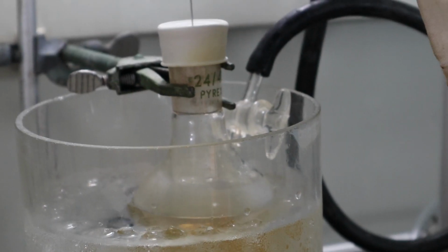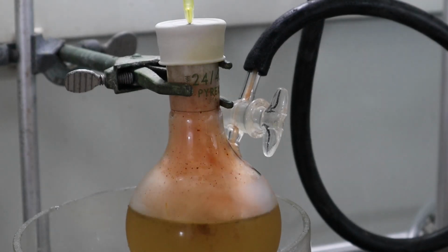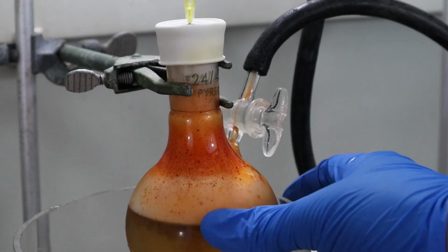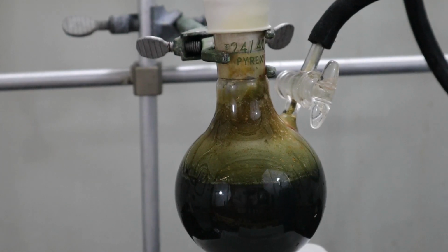When I started the addition, the smoke in the flask looked so interesting I decided to lower the ice bath. This was a mistake. Regardless, this addition was among the most beautiful reactions I've ever done. After a short time, the color dramatically changed into a dark brownish green, which was much less exciting than the brilliant red. I left the reaction to stir overnight, or about 17 hours.